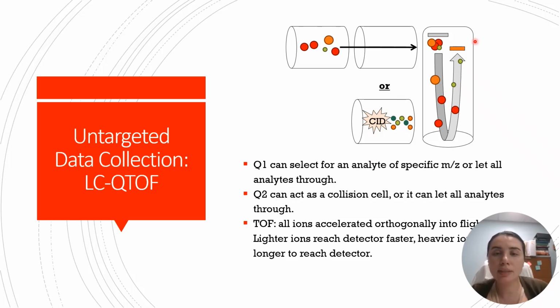And then your time of flight tube will accelerate all of the ions that go in, offering them an elongated path, and also an opportunity to separate the masses based on the specific times of flight. A longer flight path means more resolution in mass of detection and identification.